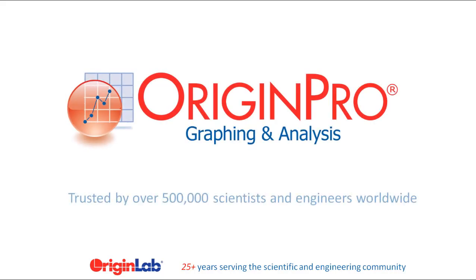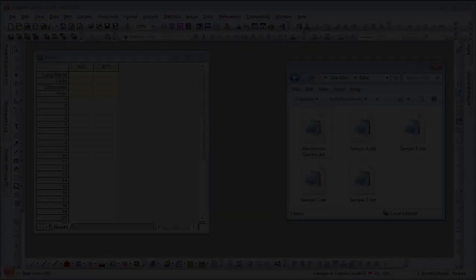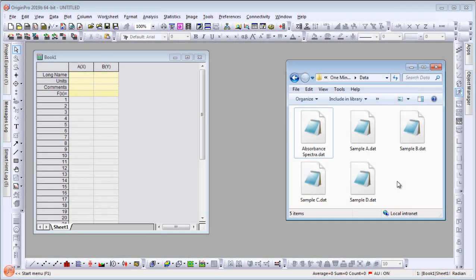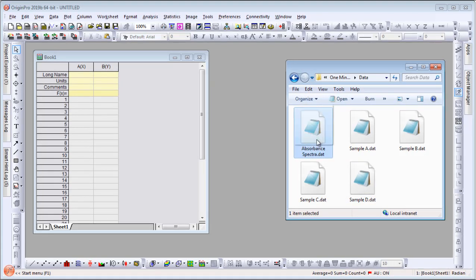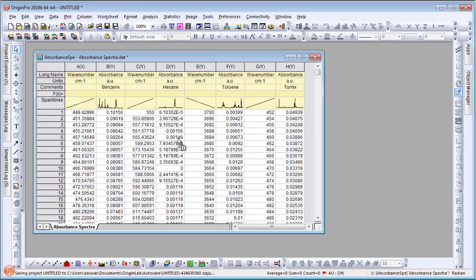Origin is a graphing and analysis software trusted by over 500,000 scientists and engineers worldwide. There are many ways to bring your data into Origin. The easiest is to simply drag and drop a file into the workspace to get started.